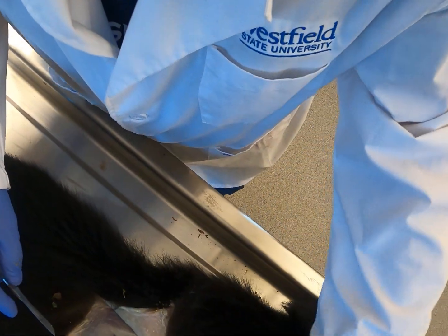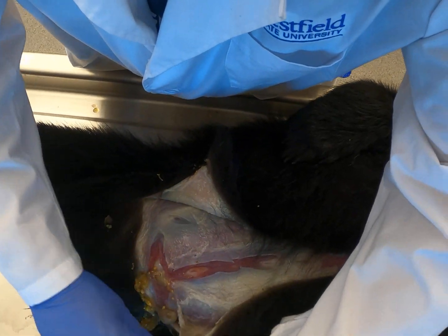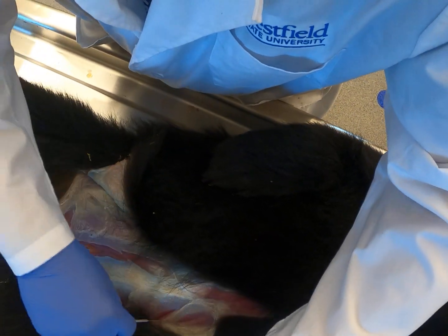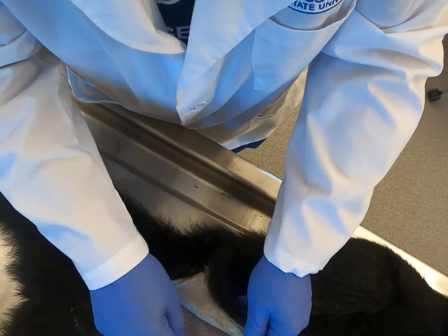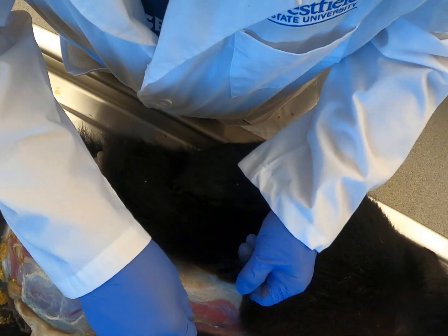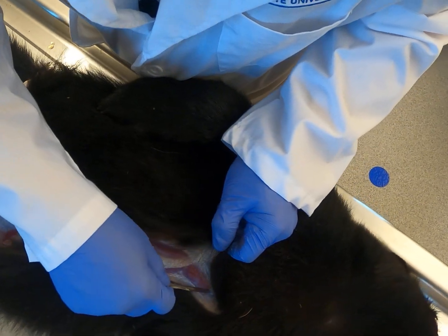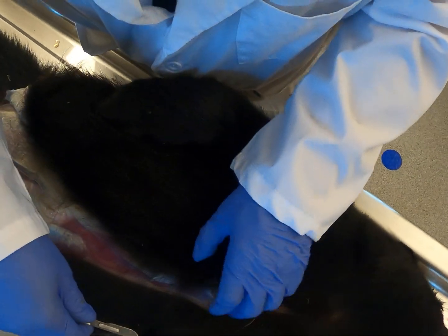Pulling the skin back and around the side a little. For those of you who've worked with skinning animals before, whether for hunting and consumption or for research and preparing skins, they really do skin a lot easier when they're warm than cold. This one was in the freezer for several months and I thawed it out for several days since last Thursday, and it's actually pretty workable.